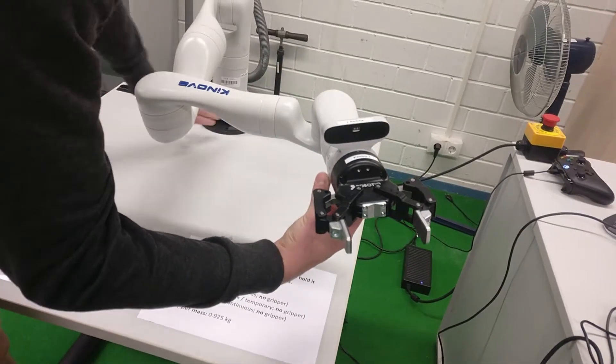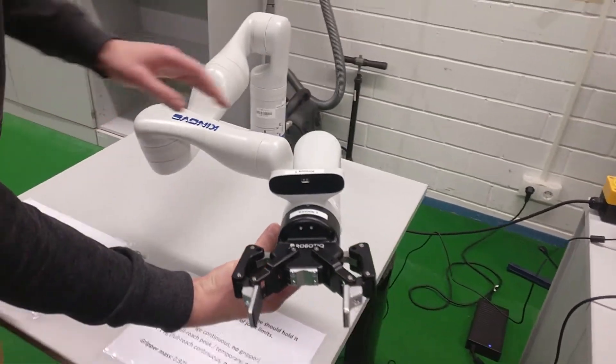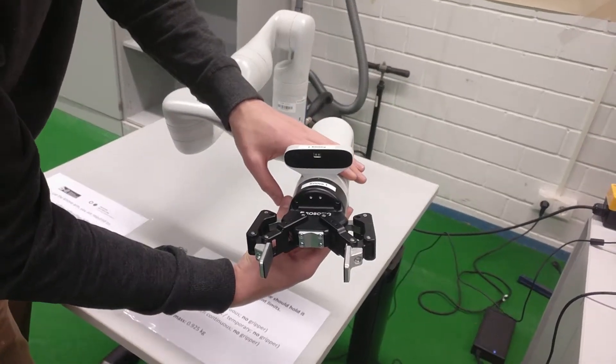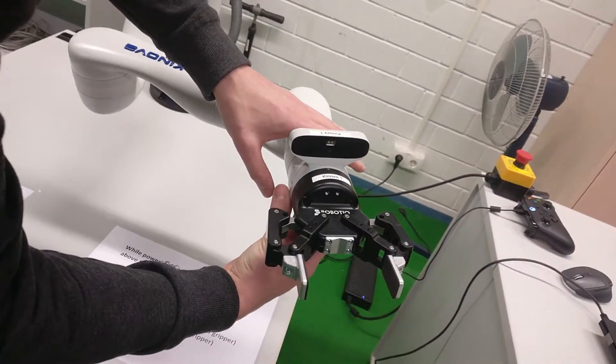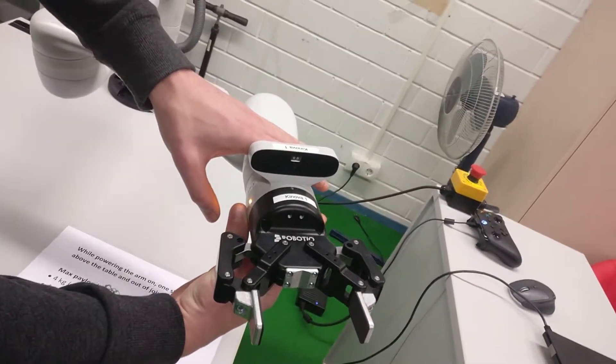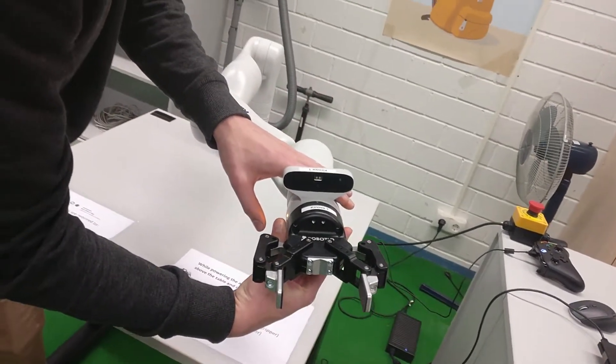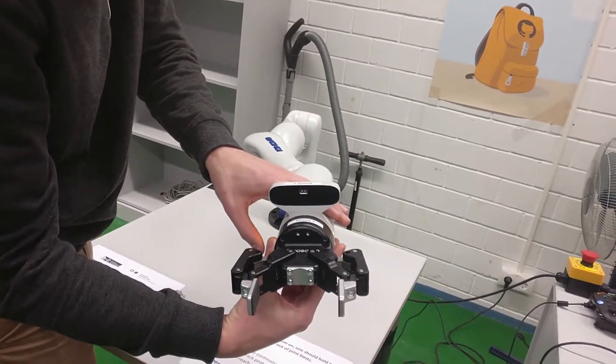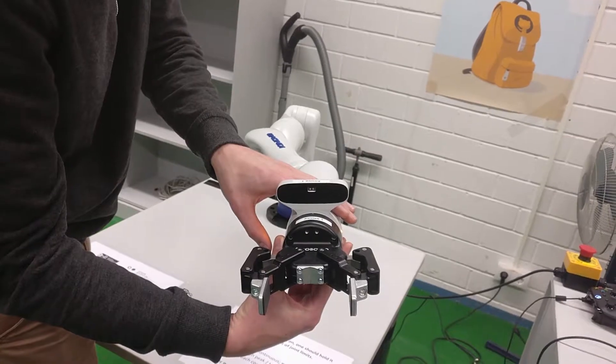In the controller in the base, there is singularity detection and joint lock detection to make sure you don't put it in any states that could damage the robot. So a demonstration of this is if you try and pull out, it will lock itself up to stop singularities.